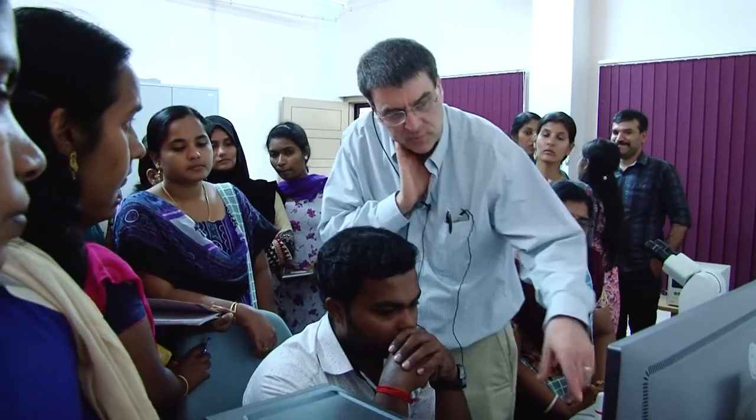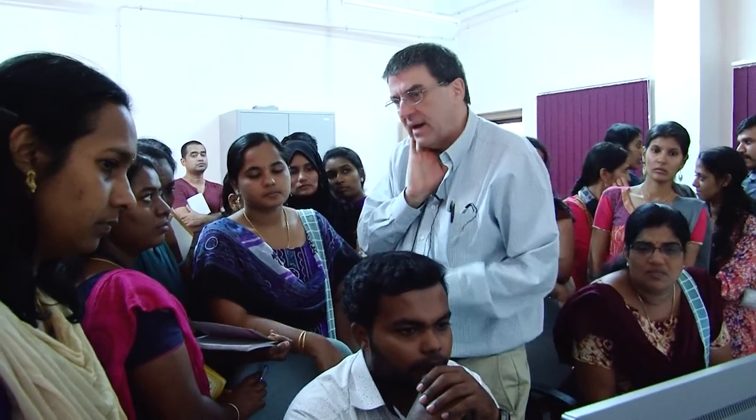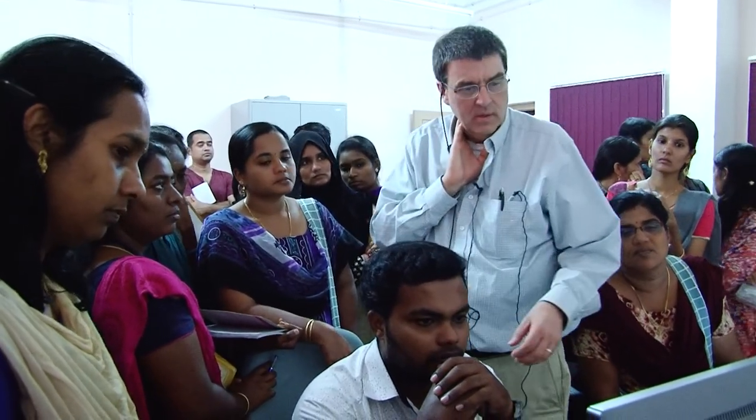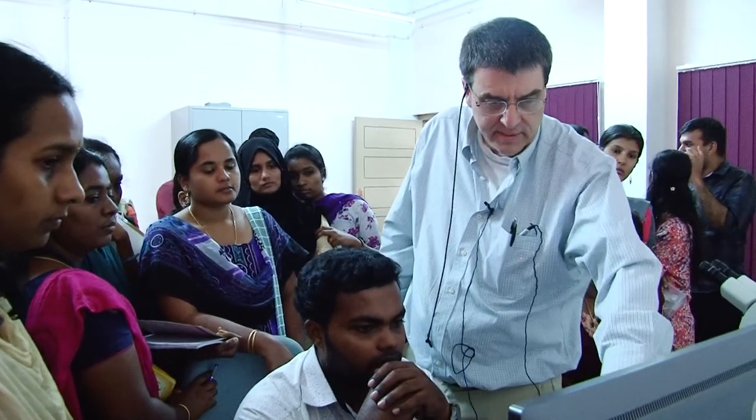Okay. But see how it's doing that first one, second one, third one, I think it's averaging on the fly. Yeah. But see how the quality's getting better? How you're getting a crisper image? Because what it's doing is getting rid of the noise. We could also go a little higher with the average.